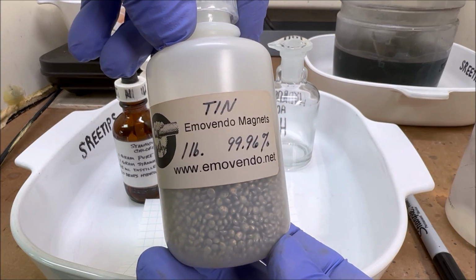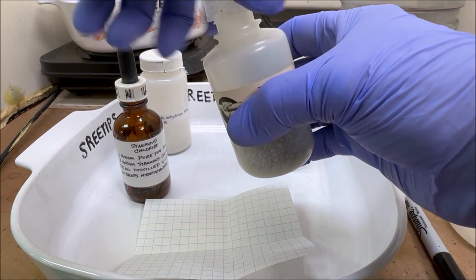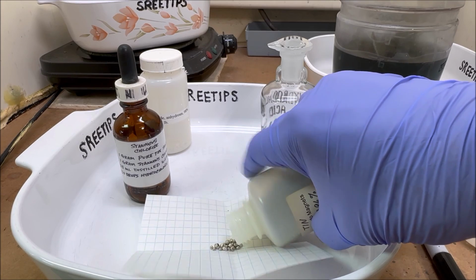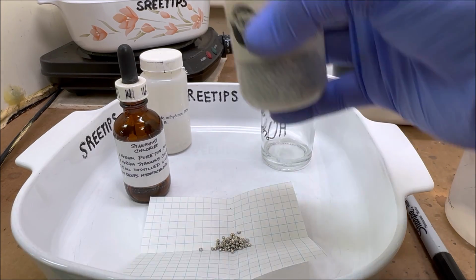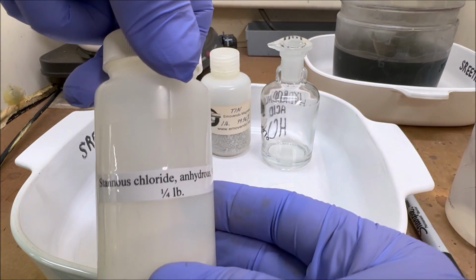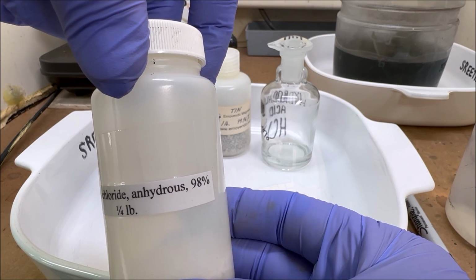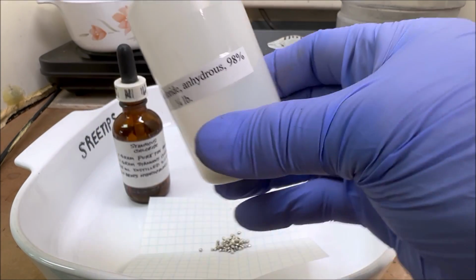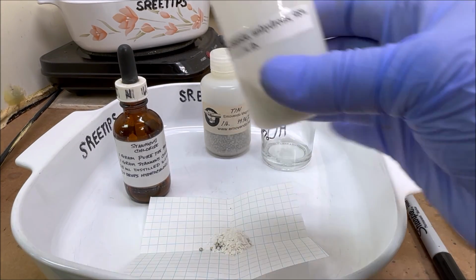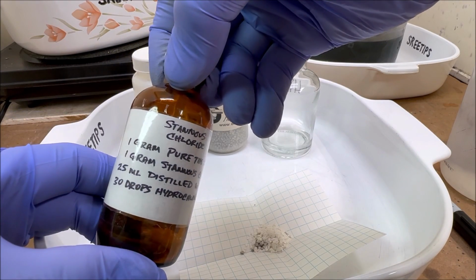This is pure tin shot. I bought this on eBay. It takes about a gram of it, which is, I just pour a little bit out, about that much. It's about a gram. And then I'm adding some stannous chloride crystals, about the same amount. I will add this to our test bottle here.